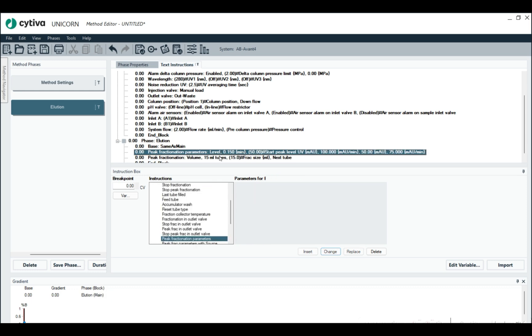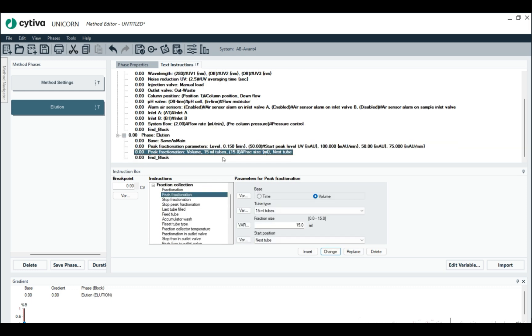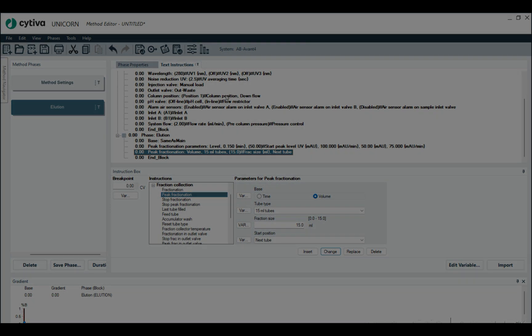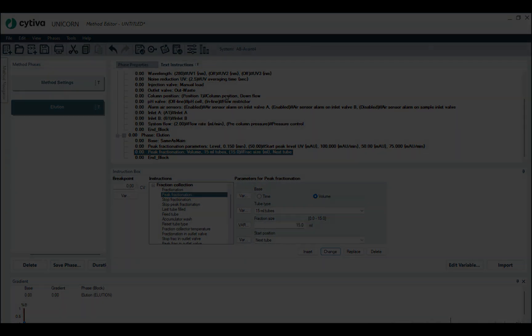There you have it. There's peak fractionation inside of the method editor, inside of the method. Thank you very much. I hope this helps with your purifications.